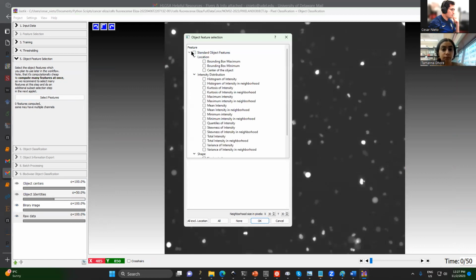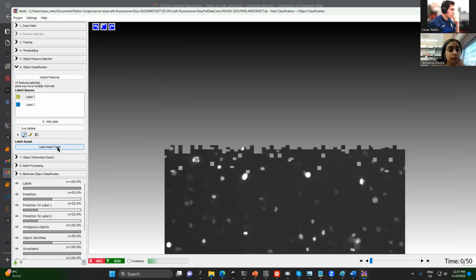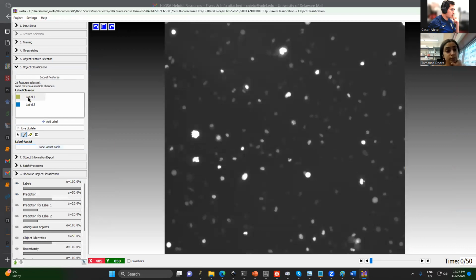And I think here we should select between, let's say, background and cell. Okay, background is this.